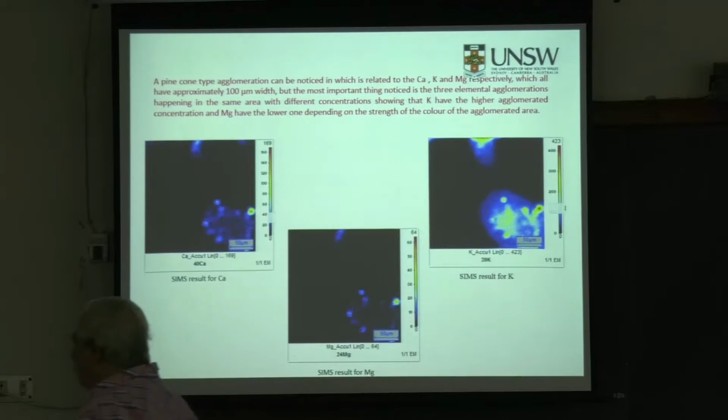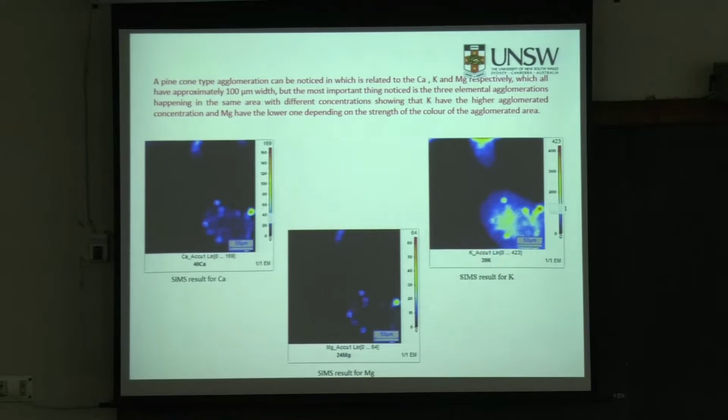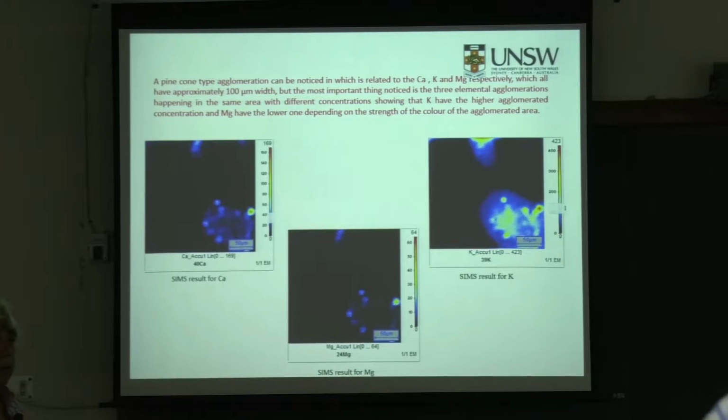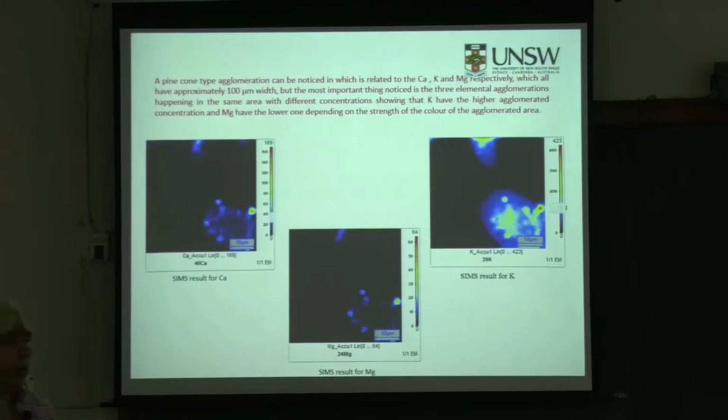So this is something new. And the very fact that even my university, University of New South Wales, Mark Wainwright Analytical Centre did not have SIMS, shows that SIMS is very expensive. But that way it also shows that some of the universities, and particularly the Nuclear Science and Technology Organisation, try to bring new facilities from other parts of the world into them.